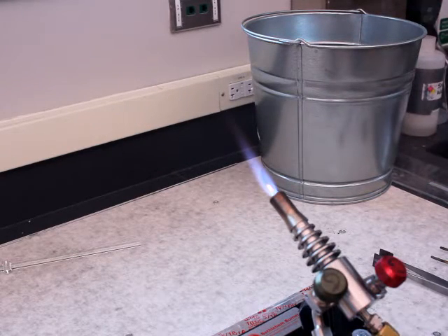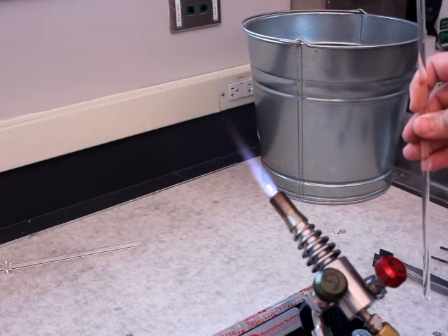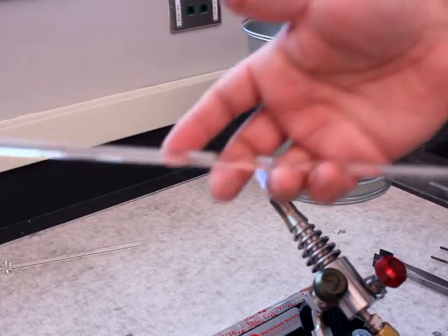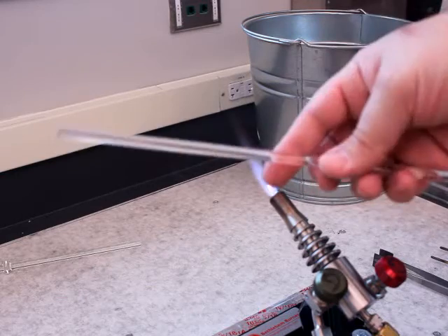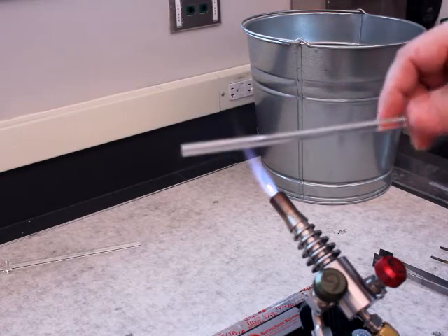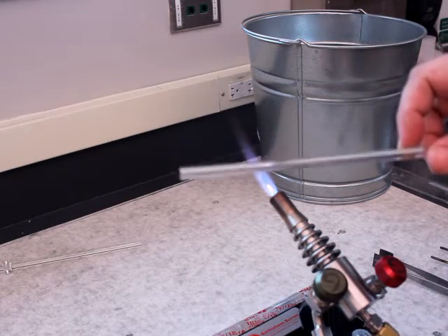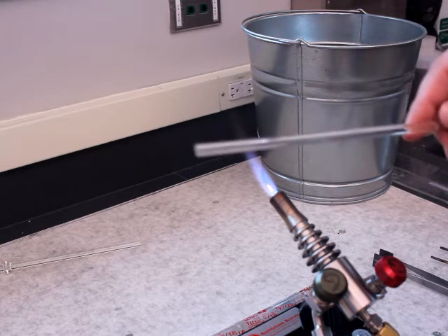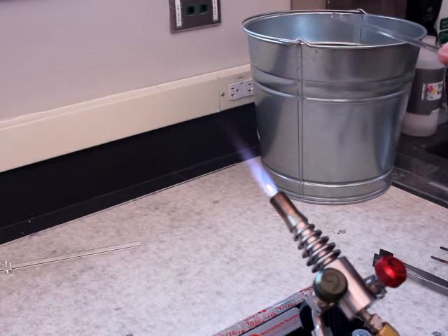I've got another rod — this is about seven millimeters in diameter, though that really doesn't matter. This rod is over one foot in length, so it does give me some issues as far as how to hold it in my hand. When I rotate, I need to get it to rotate along the axis without wobbling, and this is something that just takes some practice.